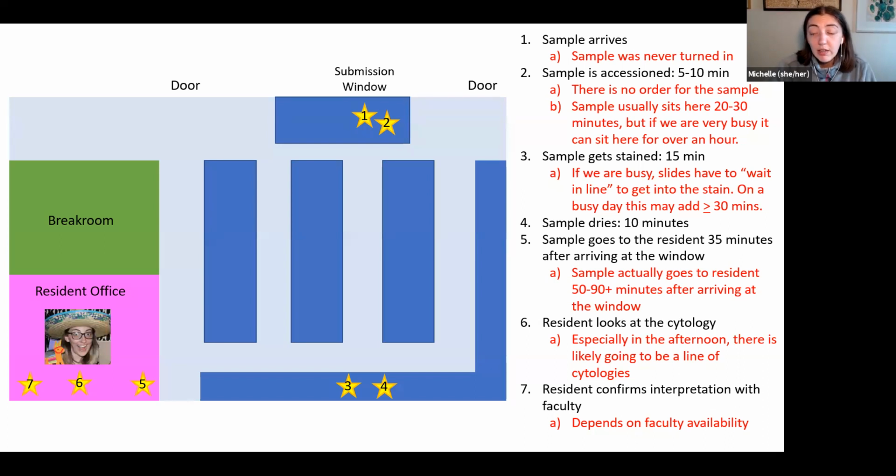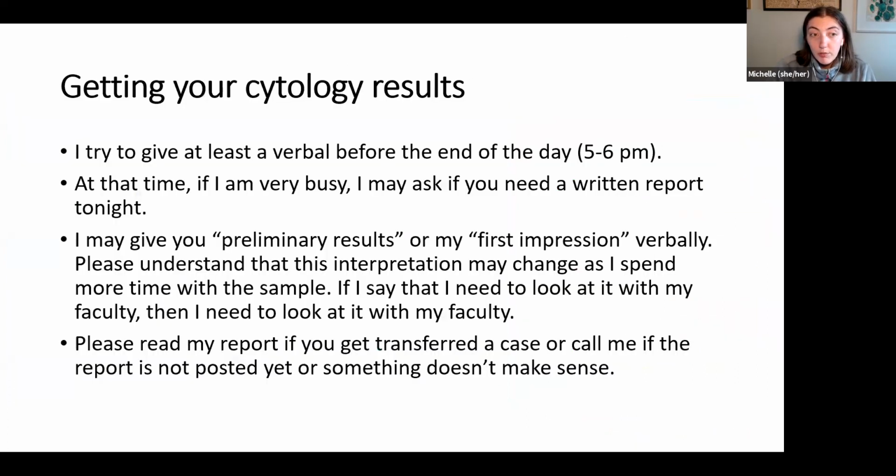And if you have a stat, make sure that you ring the bell and tell someone at the window, and then post the report. If you think you should have a report and you don't, because I've already talked to you and I told you I was going to post it, make sure you let us know, because sometimes VADS just deletes the report. I don't know why. So let me know if you think your report should be posted and it's not, and I will post it for you.